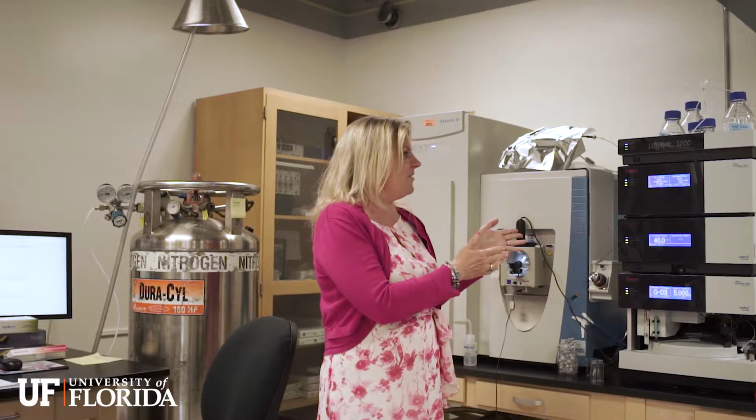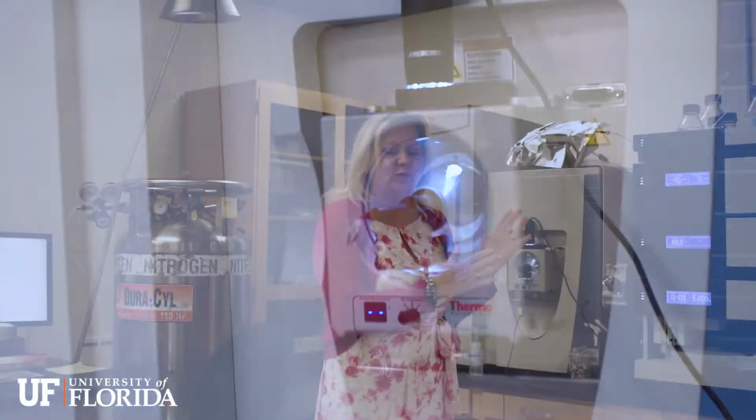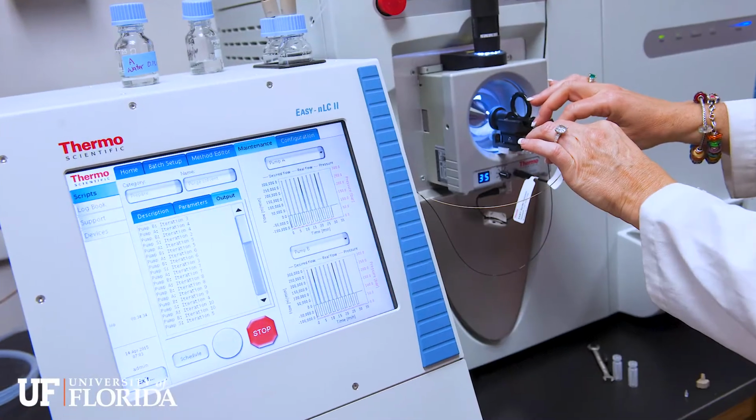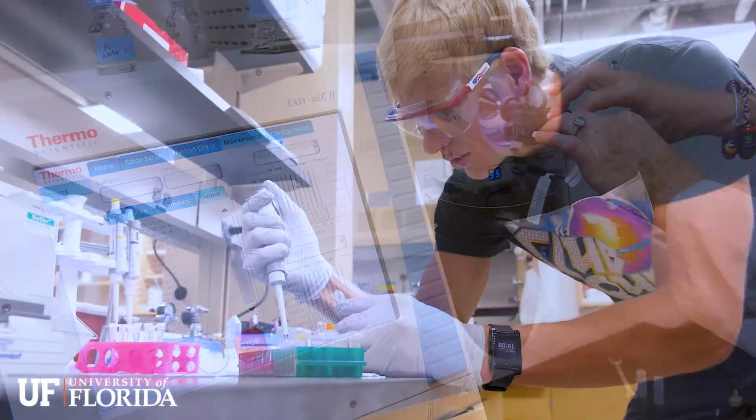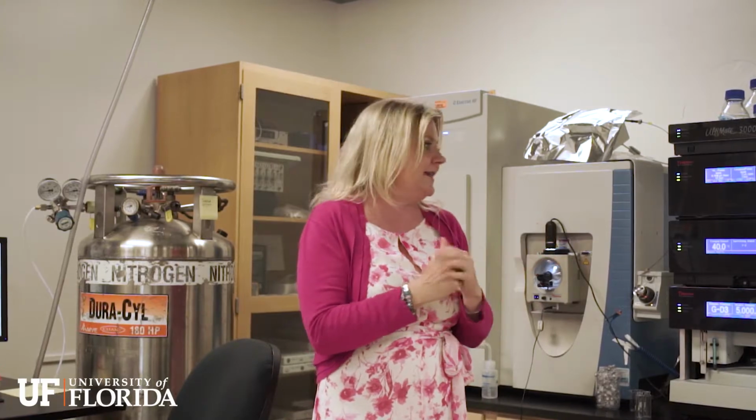So this instrument here is our Thermo Q Orbitrap instrument. It is a high-resolution MSMS instrument, and we predominantly use it to do proteomic analysis. So we can take a complex mixture, say from a cell lysate or tissue, and sequence all of the proteins that are in that sample, and we can compare it between disease states and normal or healthy states to see what differences there are.